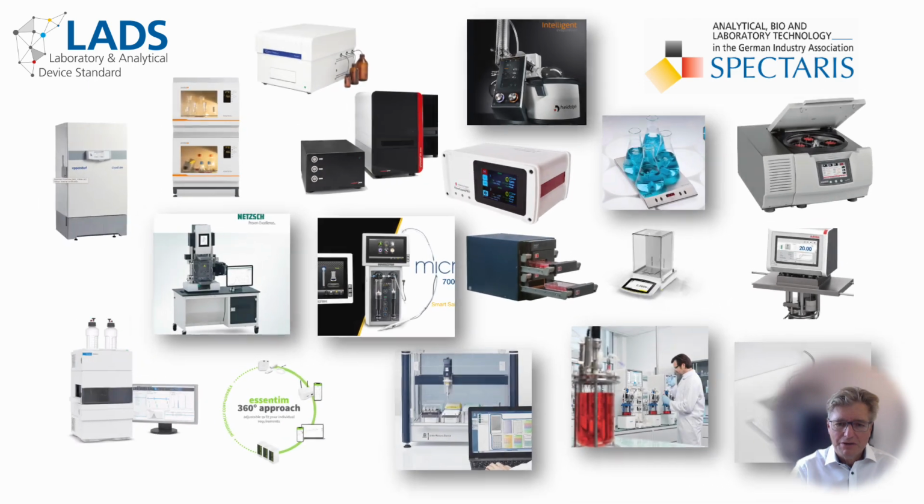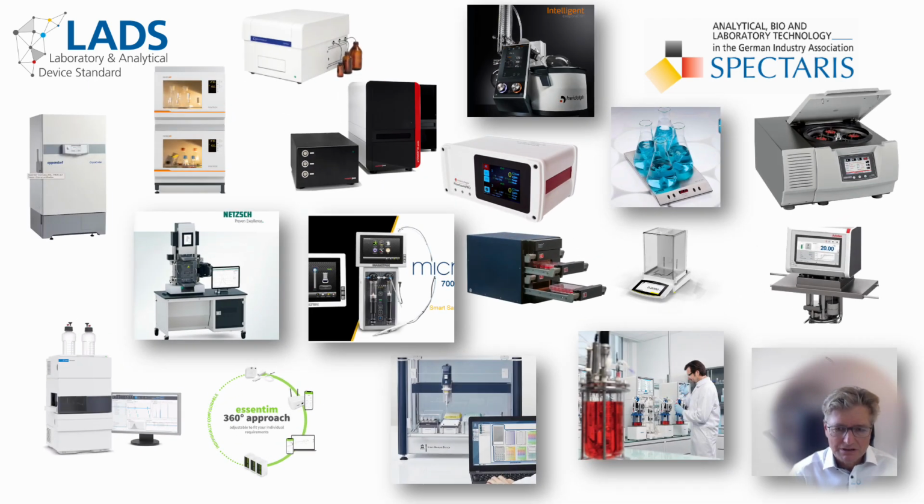You might remember the various laboratory instruments with LADS information models that I presented a few minutes ago. LADS OPC UA allows for standardized integration of these instruments into automation applications, leading to several benefits including better reproducibility of processes, improved data integrity, increased efficiencies, automation of tedious operations, and more.